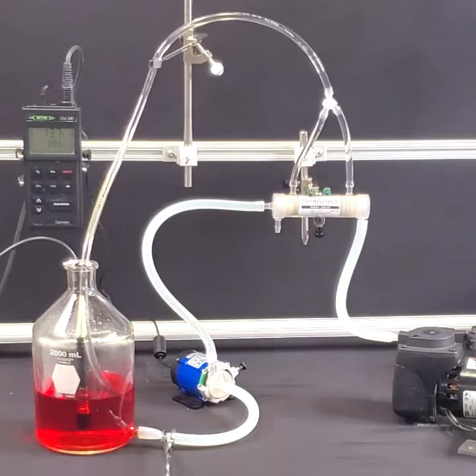This video demonstrates how to use a PermSelect silicone membrane gas exchanger to oxygenate bioreactor media and fermenter broth. Shown in this setup is a two-liter bottle containing one liter of red dyed water simulating cell culture media.